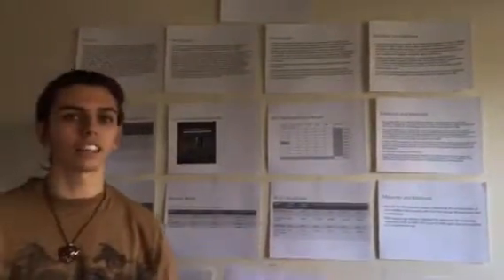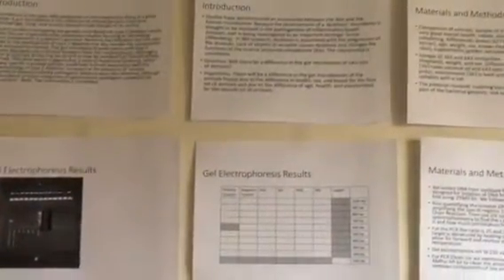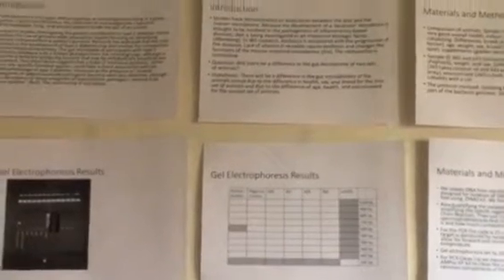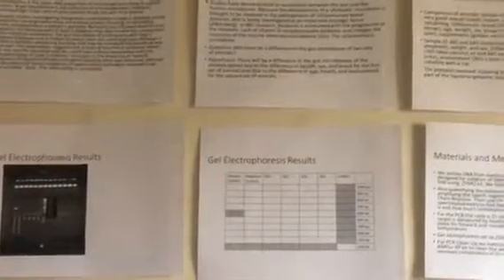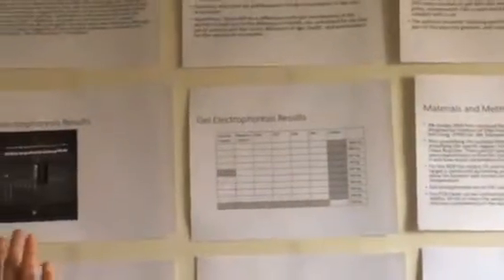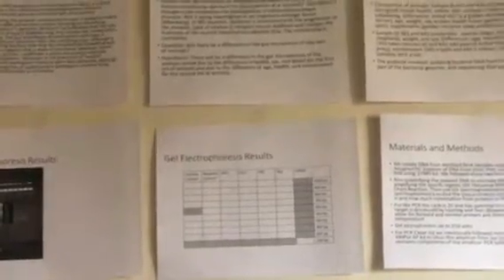So the question that we were asking is, will there be a difference in the gut microbiome of two sets of animals? Our hypothesis was that there will be a difference in the gut microbiome of two animals. For the first set of animals tested, it'll be in health, sex, and breed. For the second set, it'll be in age, health, and environment.